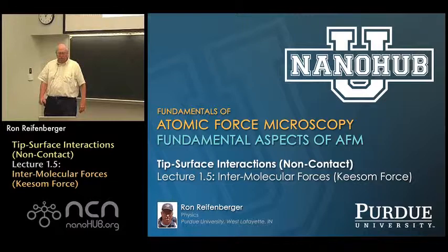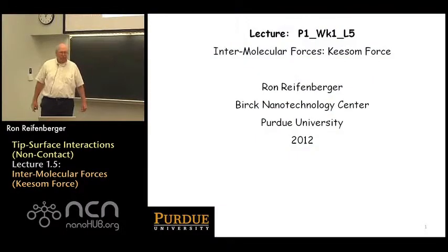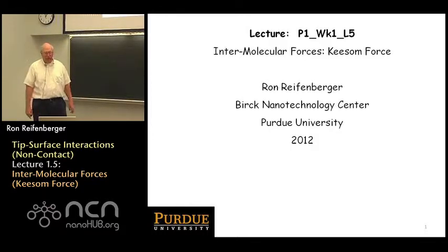nanoHUB-U, online instruction. So welcome to Lecture 5 in this first week of courses on the fundamentals of AFM. In this first week of lectures, we're basically trying to systematically work our way through all the interaction forces that might arise between a tip and a substrate.